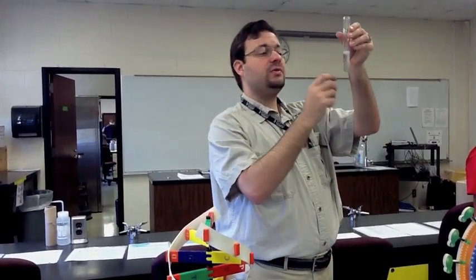DNA is charged, and alcohol has no charge to it. It's not water. It drew the DNA up out of this solution into the alcohol. Then we took the hook, grabbed it out, and looked at it under the microscope. As far as I know, we're probably not going to have the wet mount slide of the DNA on the test. You will just have this.